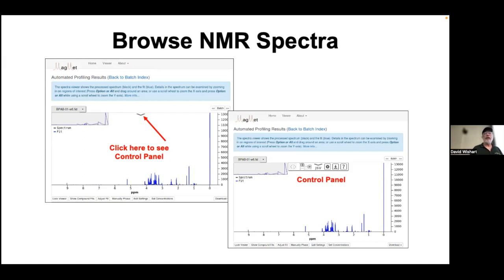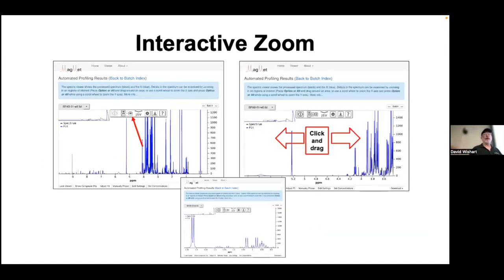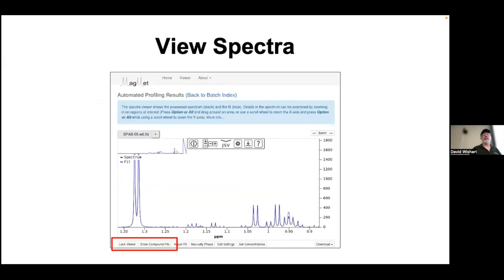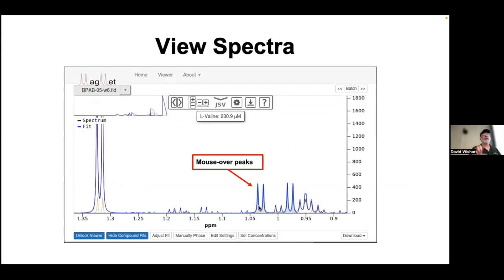You can expand and blow up your spectrum, zoom in, drag across it, and see how things are fitting. This interactive zoom is available for all spectral views. You can show your compound file, adjust your fit, lock your view. Once it's done, spend a few minutes exploring — mouse over and click on peaks to identify things. You can search by name; typing in valine, for example, will highlight the valine chemical shifts in the spectrum above.